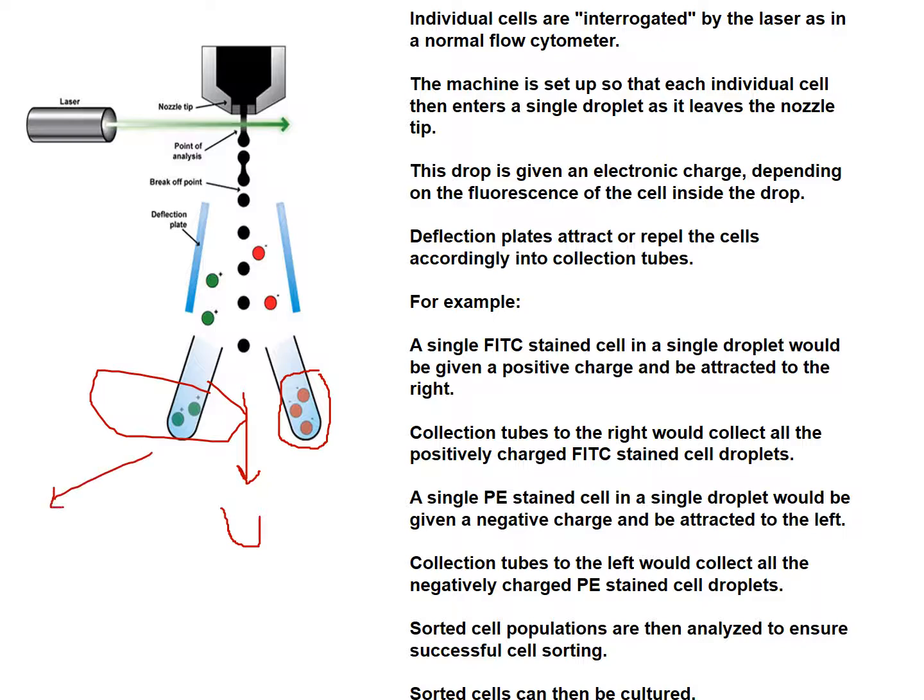So then each one of these is cultured, and you have new cells that now can be studied, depending on the property. So if you took a tumor, shook it up, and you stained for two major cancer proteins, you could divide the tumor cells into those that had a lot of whatever the green is detecting or the red, okay?